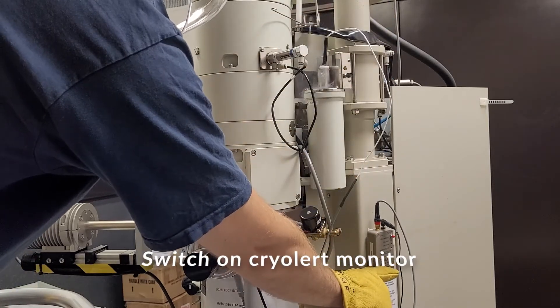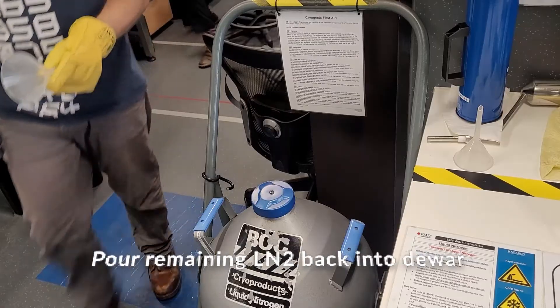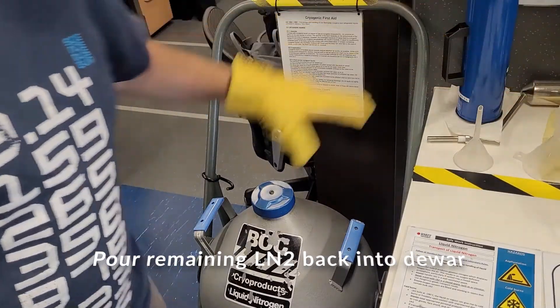Switch on the Cryolert monitor. Notice the LED goes from red to green as the system cools. Pour the remaining liquid nitrogen back into the dewar.